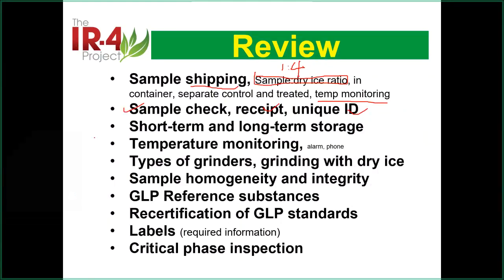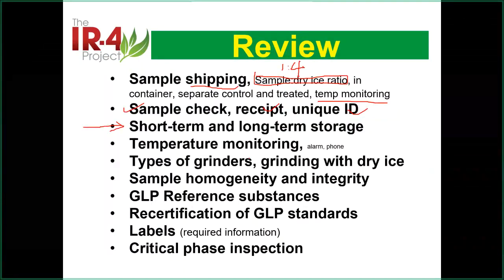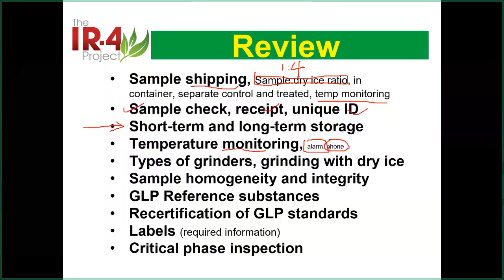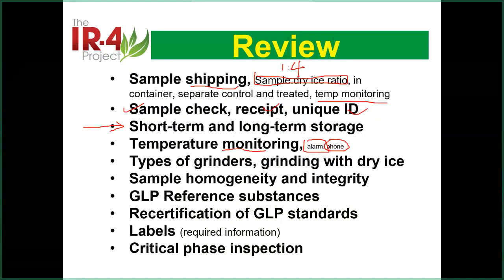So we talk about the storage. So short-term storage, long-term storage here. So again, we have to do temperature monitoring. Okay, for example, do you have the alarm system? Do you have the emergency measures, for example, if something happens? And what's the corrective action? So if it goes wrong, okay, we talked about that.